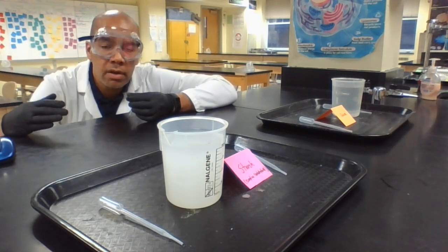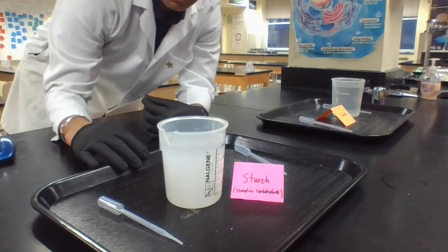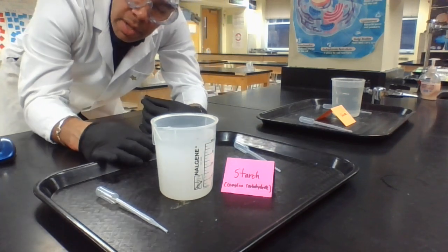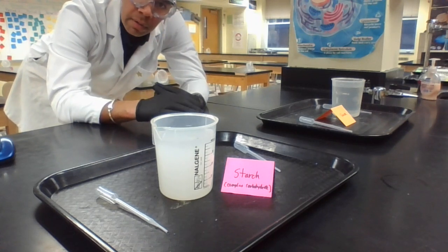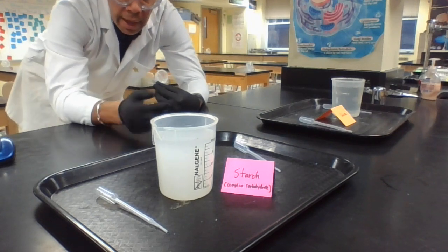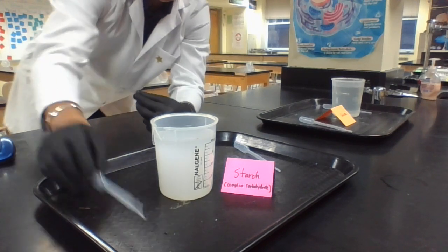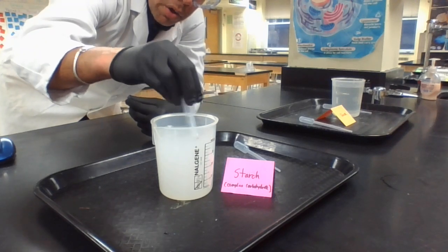Hey, back over here. So what you're going to do is, this is the starch right here. Okay, so this represents the complex carbohydrates that we were seeing in our data from the food molecules with the graham crackers yesterday. And so starch solution is going to be kind of like a cloudy water.